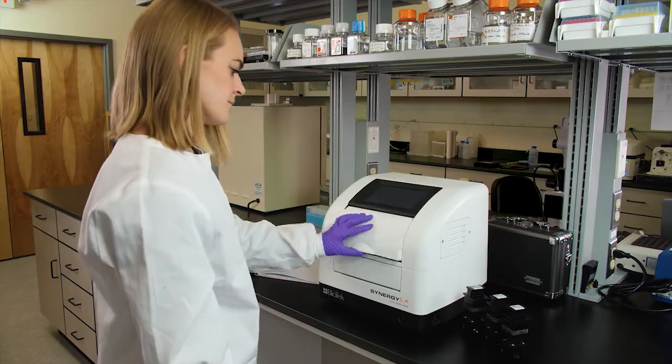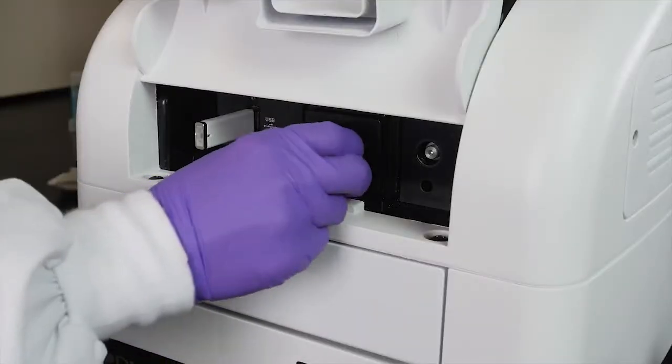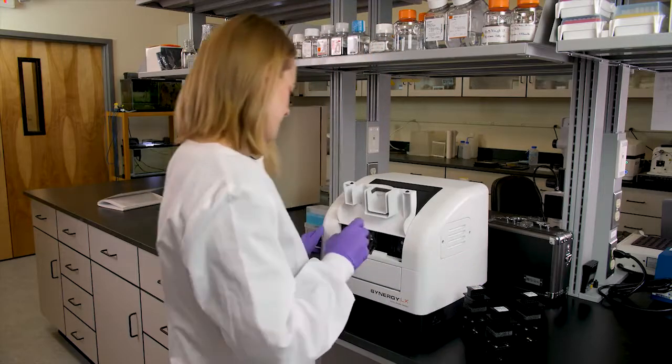The fluorescence and luminescence filter cubes are easily exchanged, enabling a broad range of fluorescence intensity and luminescence assays.